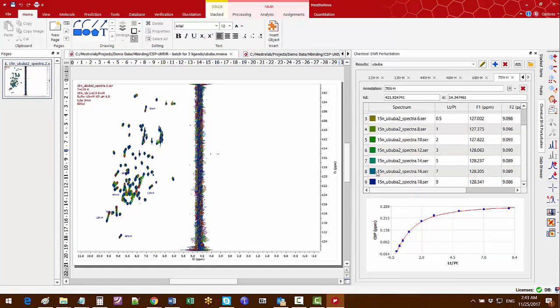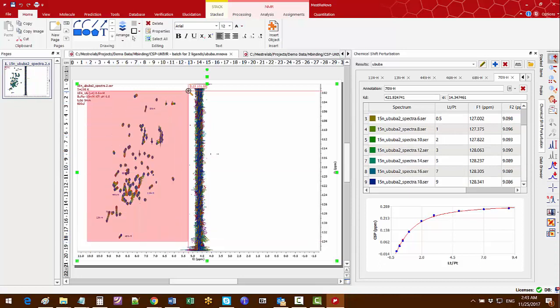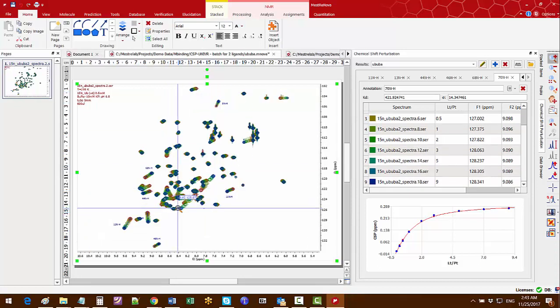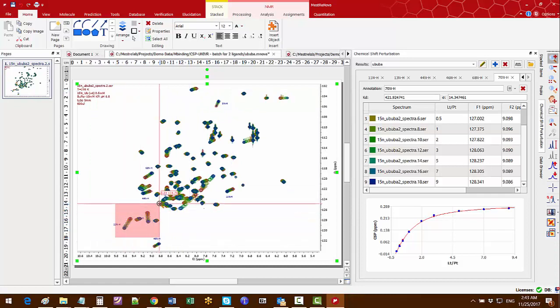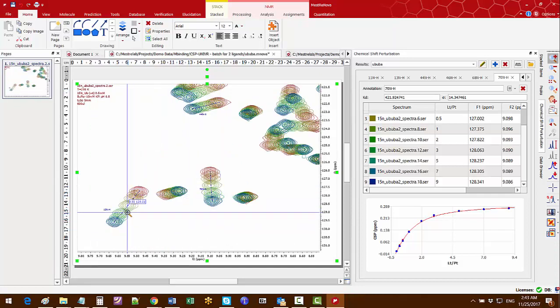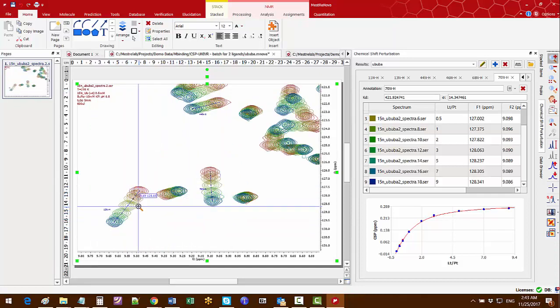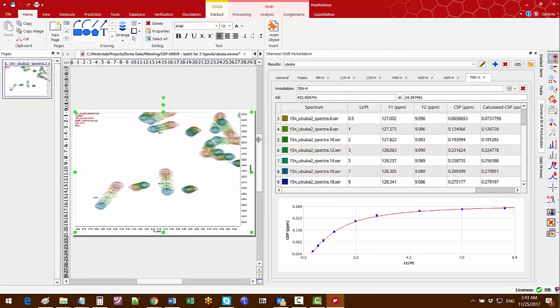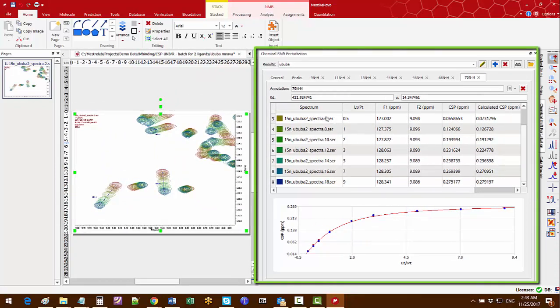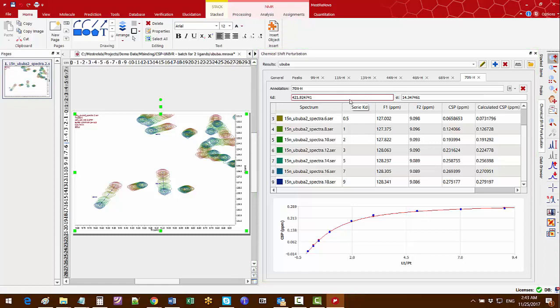Now the batch processing is completed and you will see two tabs, each showing the results for one ligand. The first one has nine spectra stacked and for each of the test peaks from the peak list the chemical shift perturbation results and KDs are calculated.